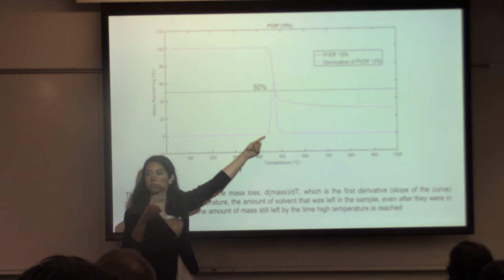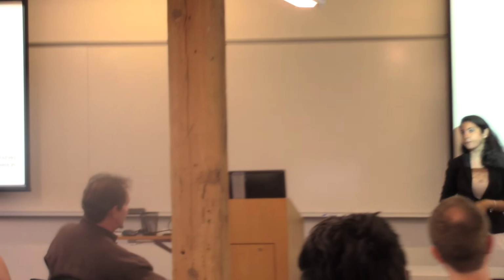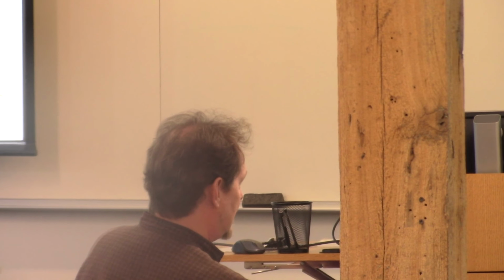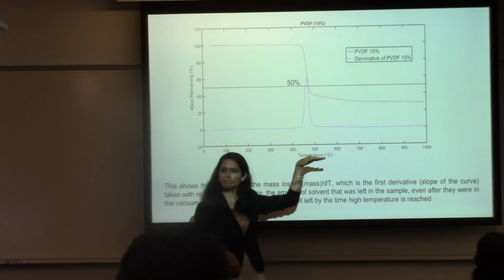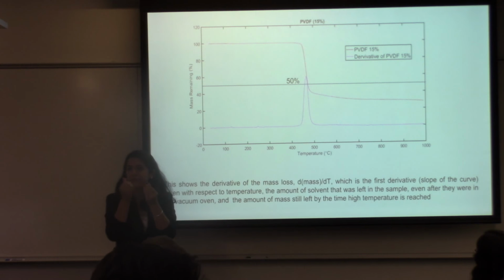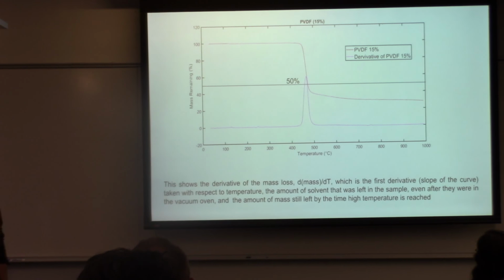And we're using also, on this line, the derivative. That's where we can determine the major degradation, which happens at that peak you see in the middle of the purple line. Also to add here, you might wonder why our material doesn't go to zero. There is a little bit of material left in the basket, what we call char, which remains. It doesn't completely burn off. So the line stays at that level.